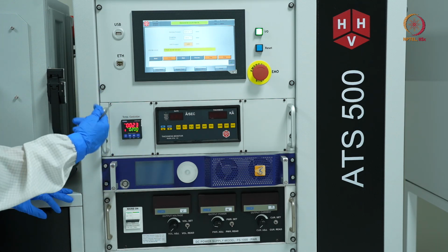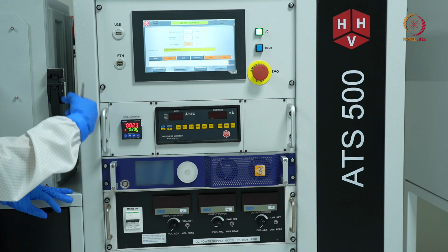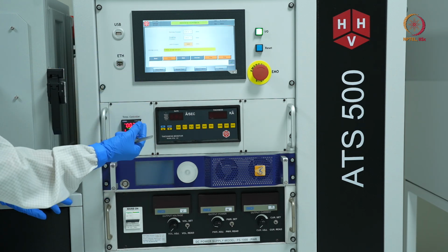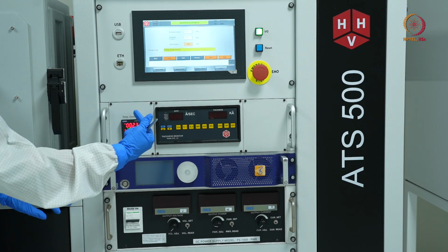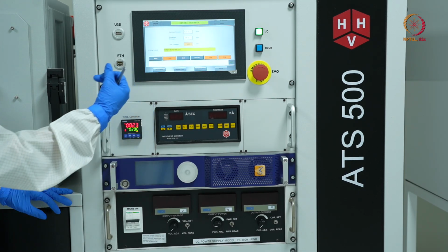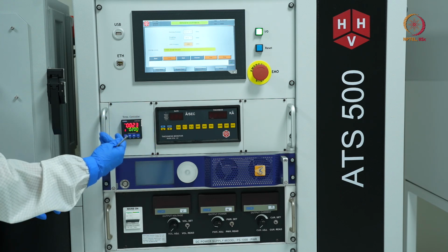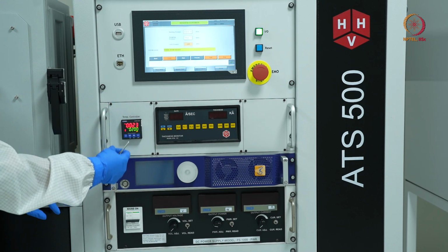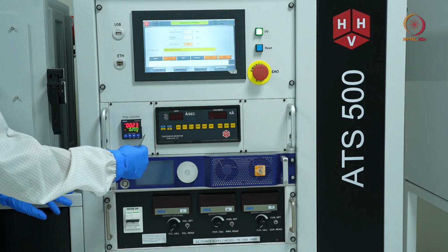So the RF signal is a pure sinusoidal signal. In the first half of the cycle, the plasma will strike, and in the second half cycle, the negative charge will be provided by the RF signal, and the argon ion will neutralize and go out of the system.